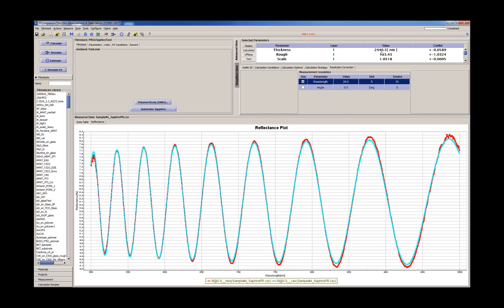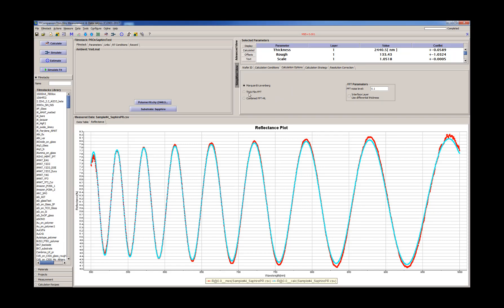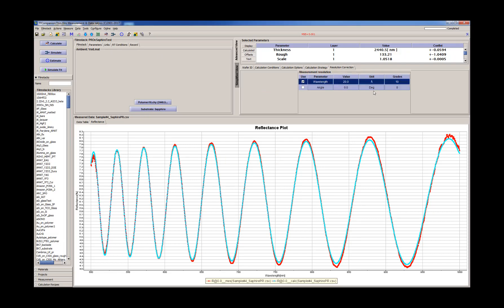If we will do now calculation here, there is no change in the thickness. So let's see now if angle have any effect.